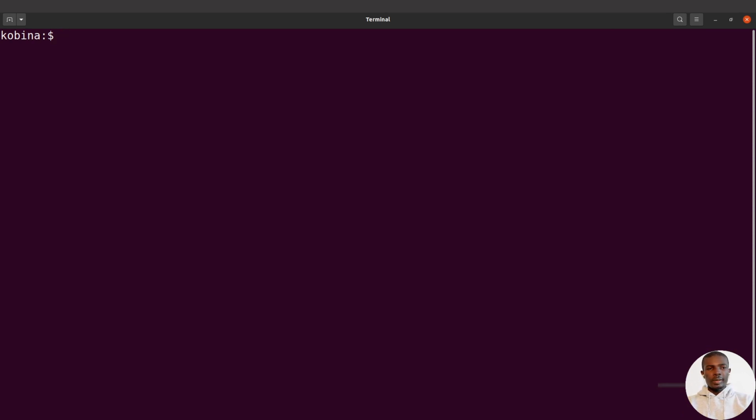Okay, we have opened the terminal. So what I'm going to do first is to create a working directory and then I'll cd into it. So I'll say mkdir nextflow. You can use any name of your choice. If you are using it for a project, then you can also use the project's name as the name of the directory. But I'll use nextflow because it's a Nextflow tutorial. And then I'll cd into it. Yeah, so now I'm done.